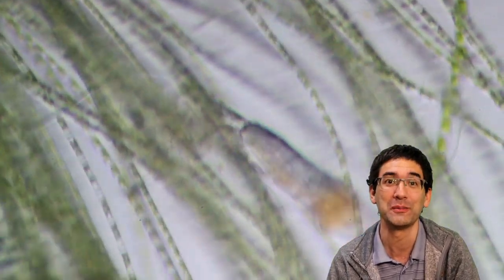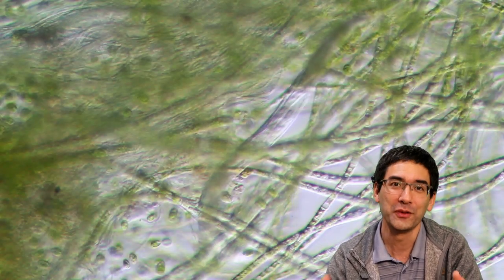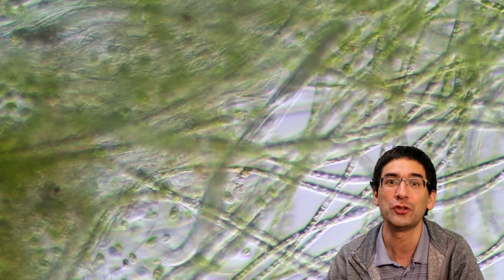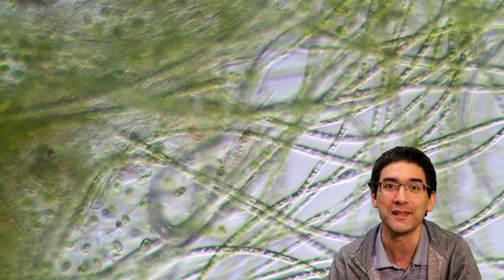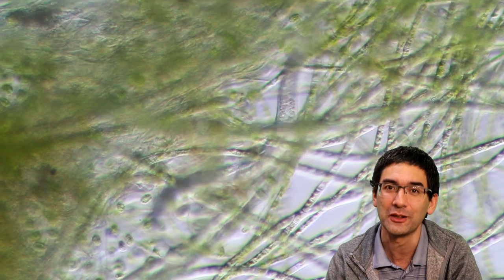After a couple of days you might be lucky because you might not only see algae growing, but maybe also some other organisms, for example, like this rotifer or these worms. As the algae grow, they build up biomass and food, and this food can also serve other organisms in the culture.